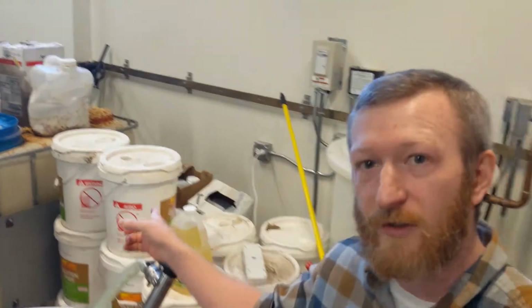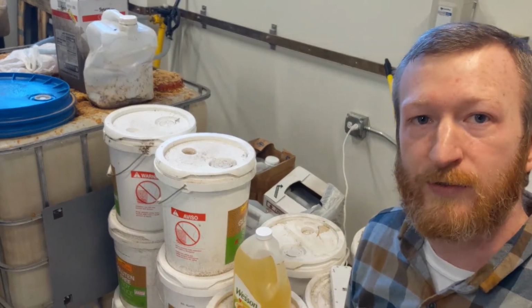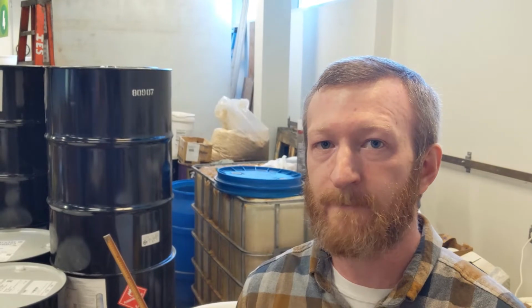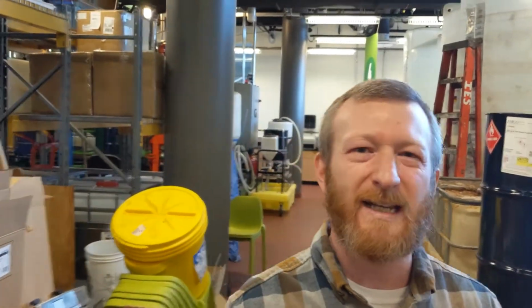So behind me here is some of the used cooking oil that we have dropped off by individuals. They come from the Rogers Park and Edgewater neighborhood, but also from all over Chicago to make sure that their used cooking oil or expired cooking oils are going to a good use. The first thing that has to happen to all of this used cooking oil is we need to remove contaminants. Specifically, we need to remove food solids, so breading and bits of chicken fingers and stuff like that.